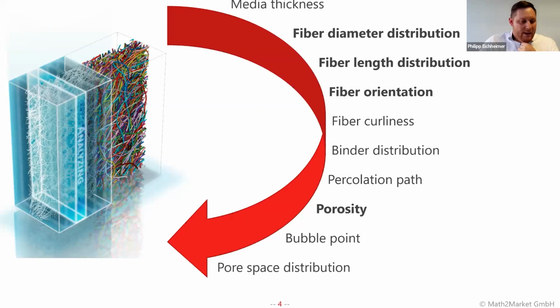Yes, so ideally, of course, we have pre-trained neural networks, which we apply to the micro-CT data, and they're most suitable when you have cylindrical fibers. But in the newest version, we also feature the ellipsoid shape, for example.